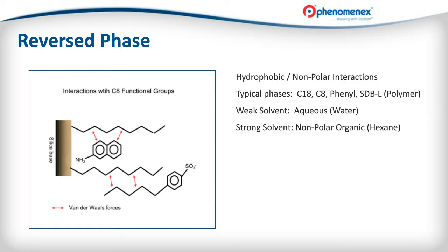So separation modes now. This is just kind of a quick look at the chemistry at play for the SPE devices that hopefully you will be doing method development on. Reverse phase interaction, van der Waals forces, relatively weak in the scheme of things, to be honest with you, but basically kind of like attracts like in this case. So we have this hydrophobic interaction between these more bulky constituents of some of our analytes of interest.